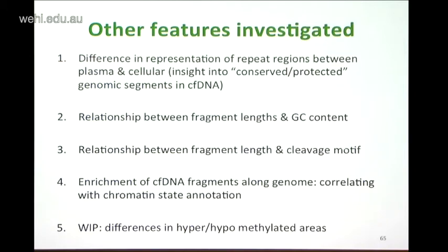We looked at the relationship between fragment length and GC content, the relationship between fragment length and cleavage motif, and we were also very interested in looking at the enrichment of reads along the genome. We wanted to see whether we got stacks of reads that corresponded to chromatin state. For example, open chromatin and then sort of closed chromatin, or nucleosome-bound positions. And we also want to see whether there's any difference in the features between hyper and hypomethylated regions.